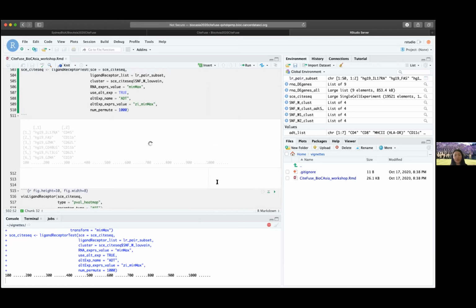Okay, while we are waiting for the function to run, oh, it's actually finished now.